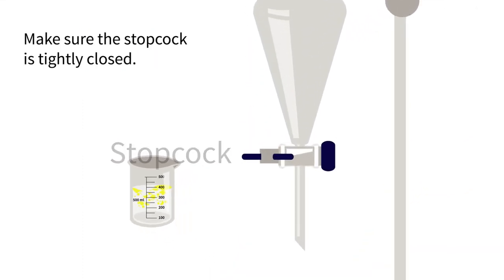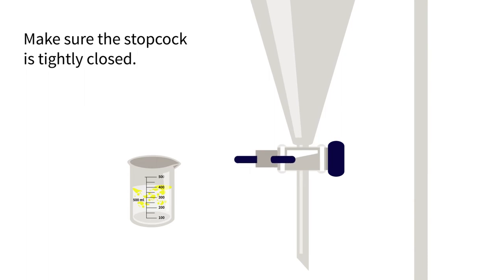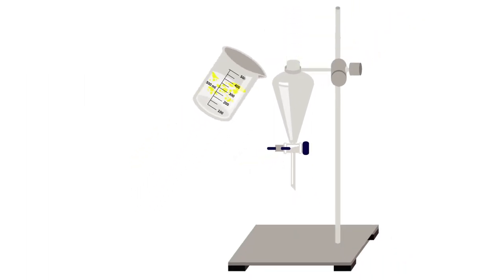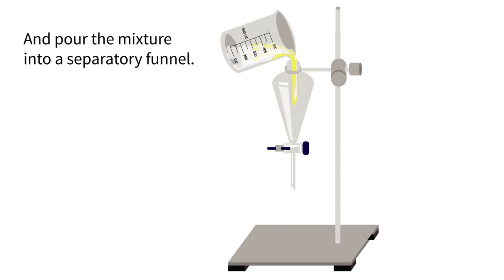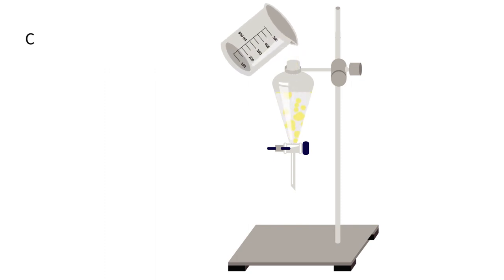Make sure the stopcock is tightly closed and pour the mixture into a separatory funnel. Close the funnel with a stopper and allow the mixture to stand for a while.